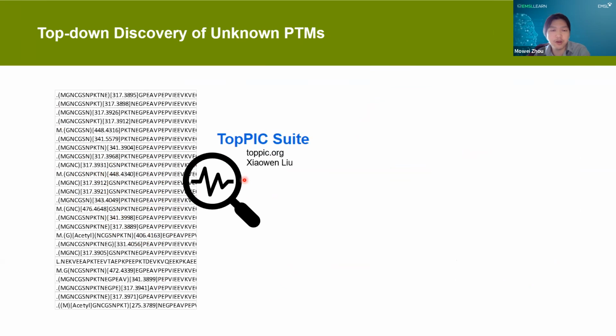So the next topic I want to mention in the soybean nodule project is the ability to really discover unknown or unexpected PTMs. There are a lot of software tools that can do open search, and I usually use TopPIC Suite from Xiaowen Liu's group. The way I do this is, when we look at the results, we just sort the proteoforms in the Excel table. And in this software, when you have an unexpected modification, we'll see a mass shift annotated on the proteoform. In this case, I'm looking at one specific protein, so all the proteoforms for that specific protein.